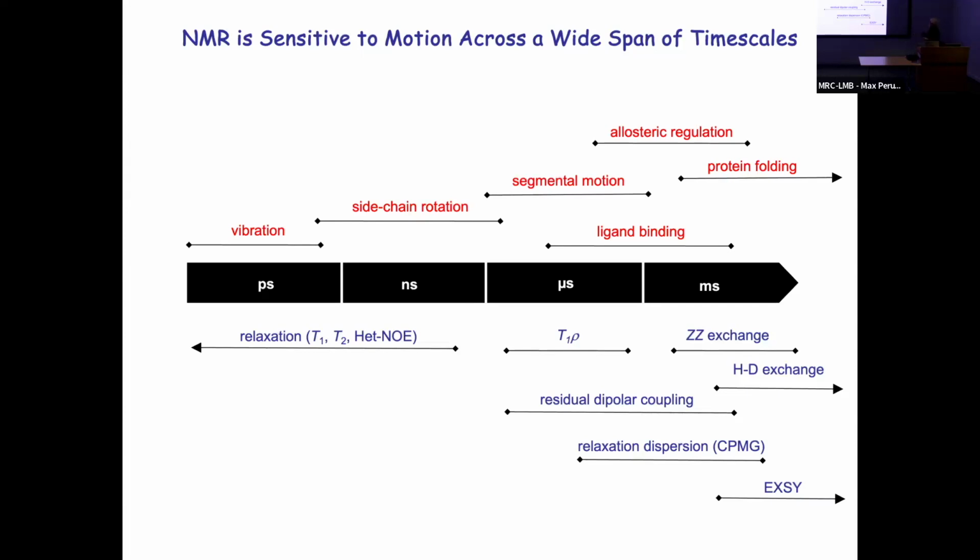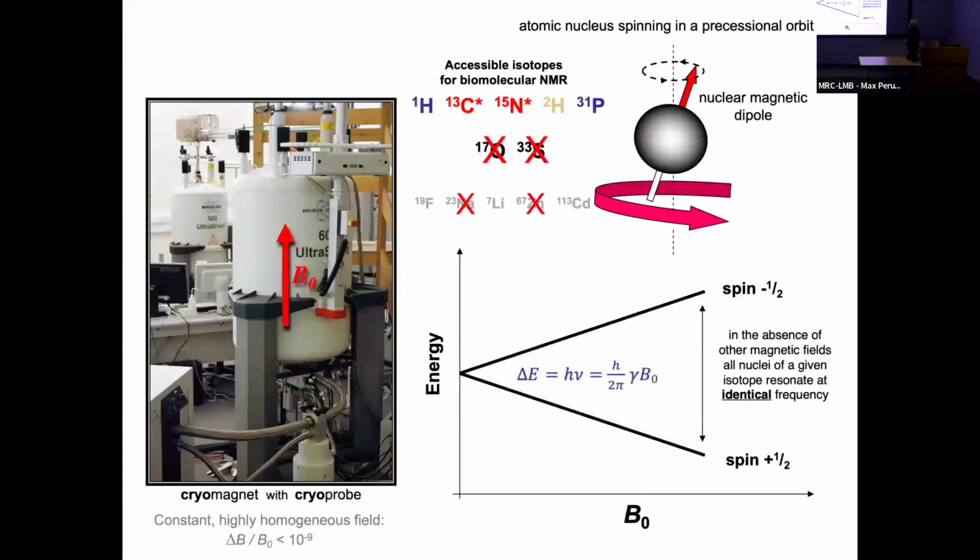And here is a range of NMR approaches that we can use that are quite specialist, and it's beyond the scope of a first introduction to go into each of these, but Jane will illustrate some of those next Tuesday. But the idea is there are different processes going on inside that we can get a handle on what motions are going on inside the solution.